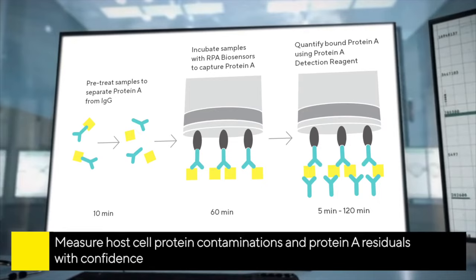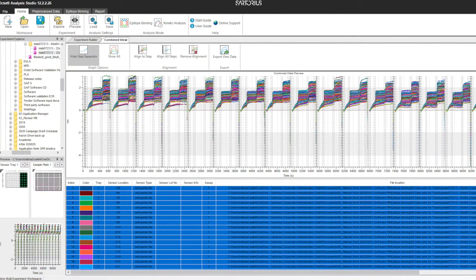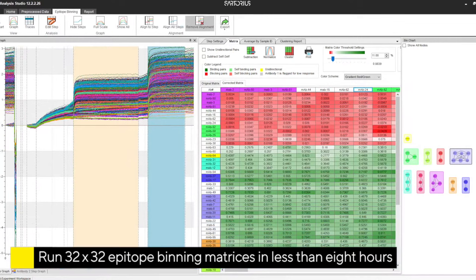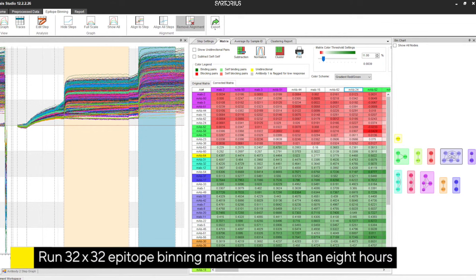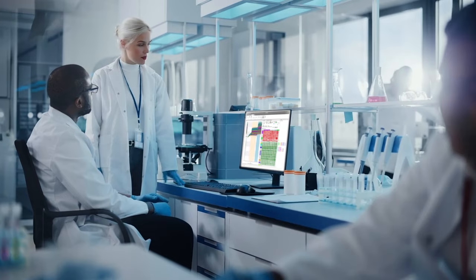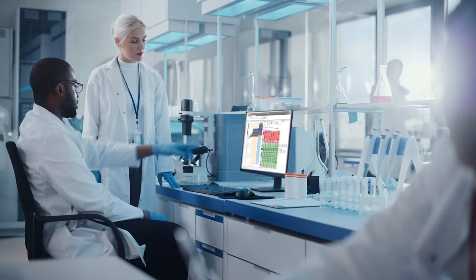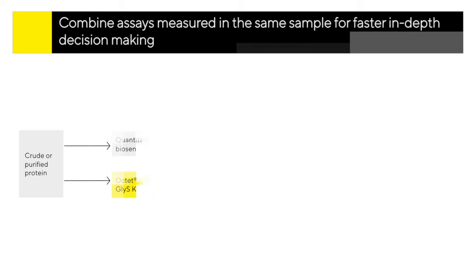These systems are also ideally suited to epitope binning experiments. For example, with the Octet RH96, a 32 by 32 matrix can be completed in record time, with a dedicated epitope binning analysis function to enable easy visualization of datasets. The software also provides a flexible data matrix that can accommodate a variety of cross-blocking formats.